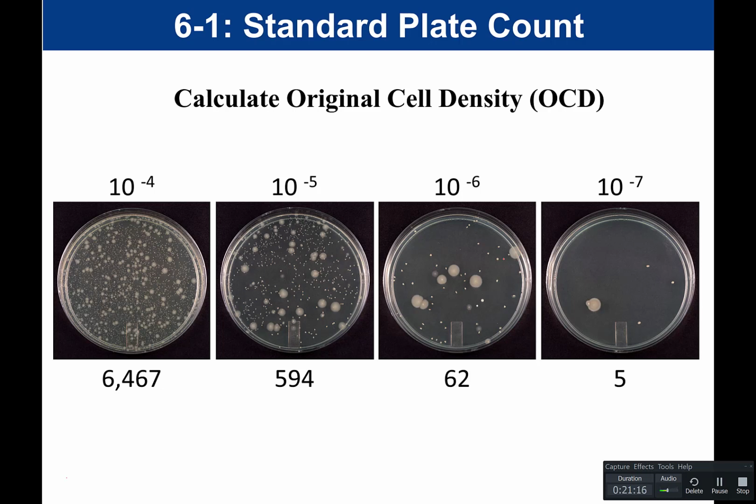So those large colonies are the bacteria that are on the top of the agar, meaning they're interacting with the oxygen in the atmosphere. The teeny tiny little colonies are the bacteria that are embedded in the agar. They're growing anaerobically, without oxygen, and they're growing more slowly because without oxygen they don't have as high of an ATP yield. So they grow a lot slower because they don't get as much energy out. And so that's why you're going to see these differences in colony size.